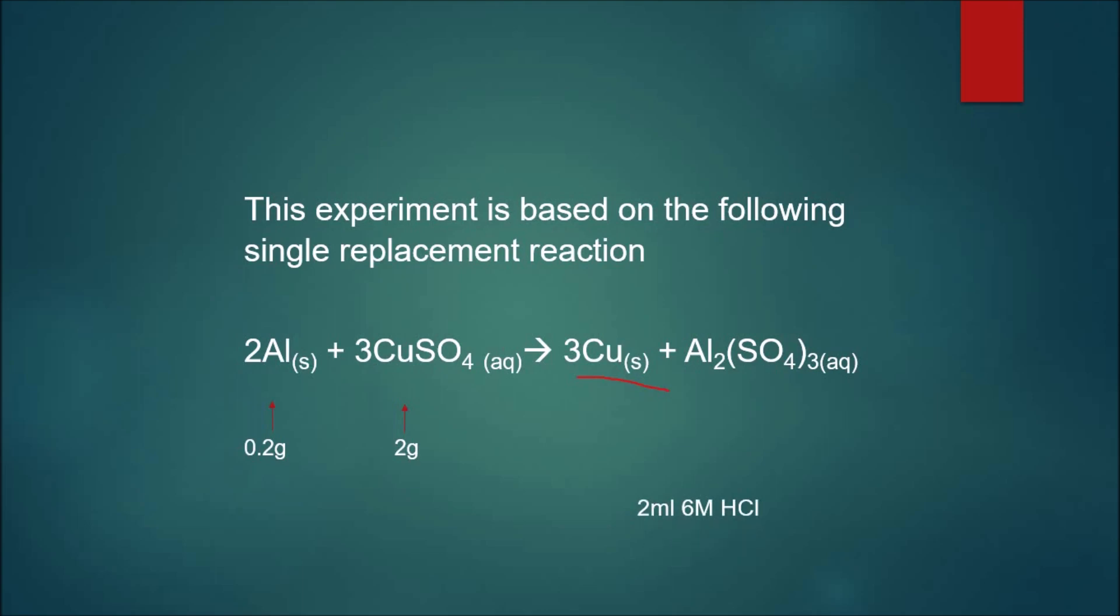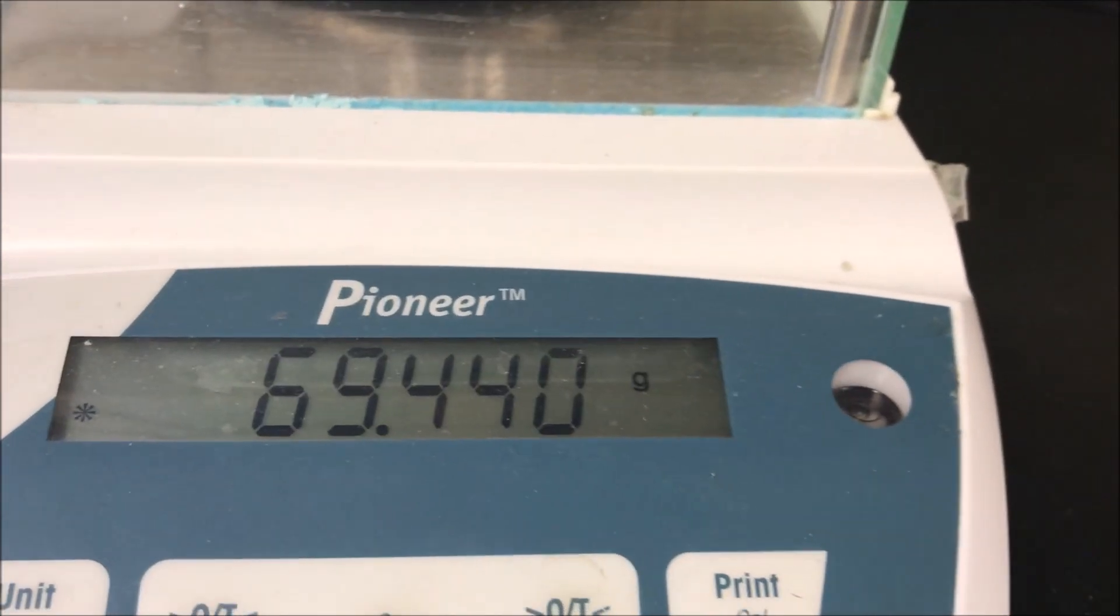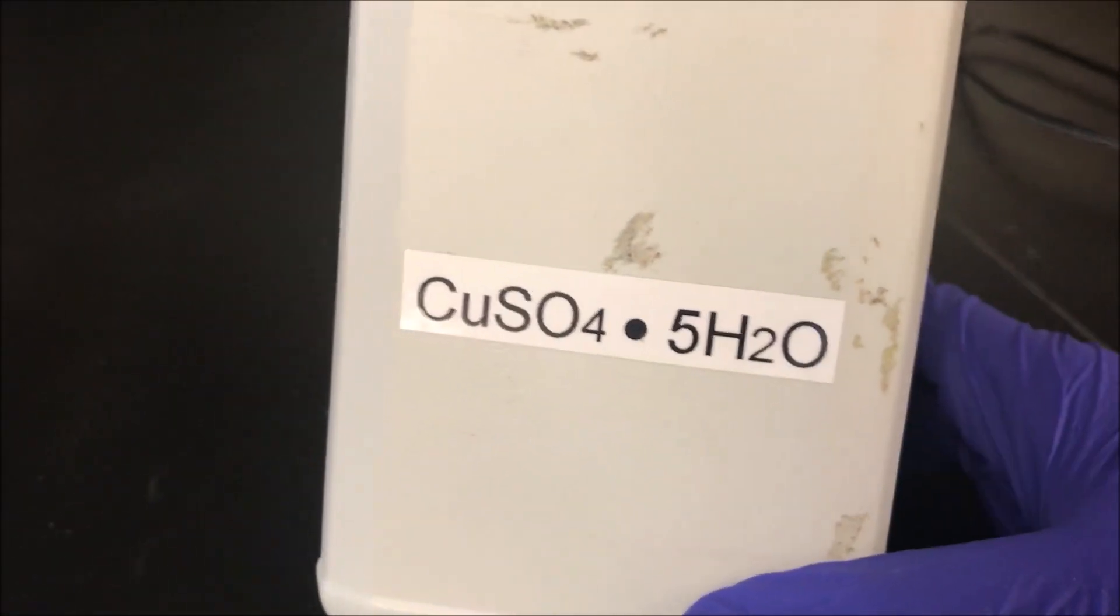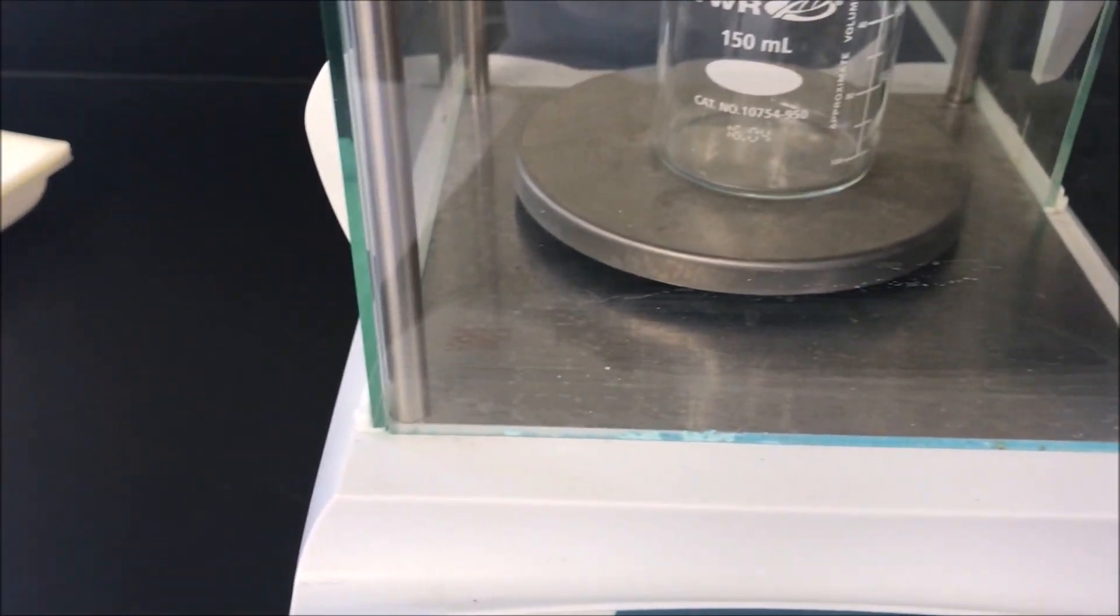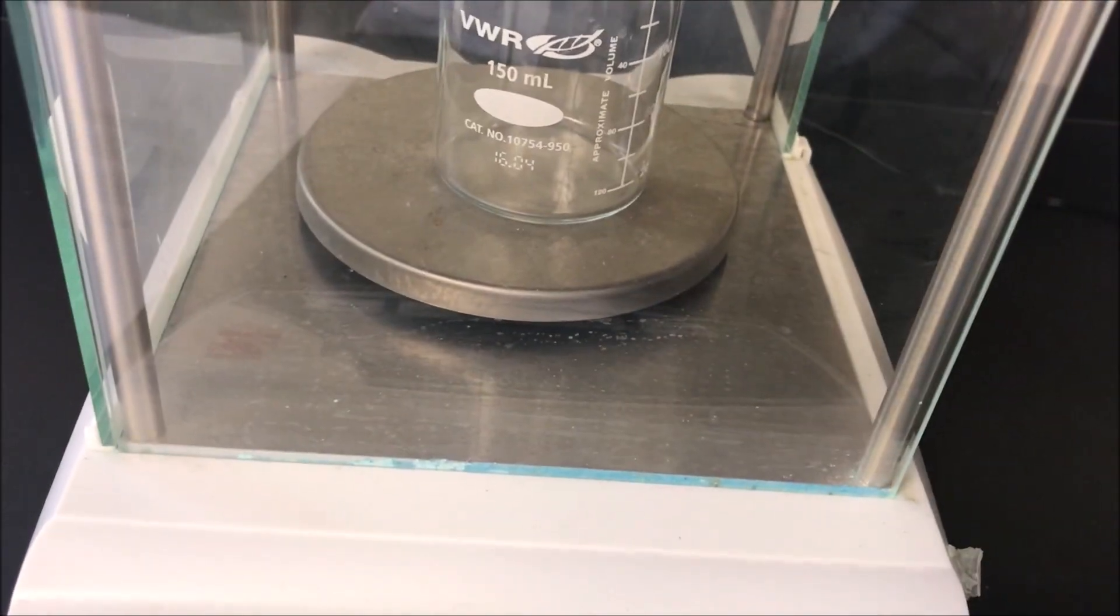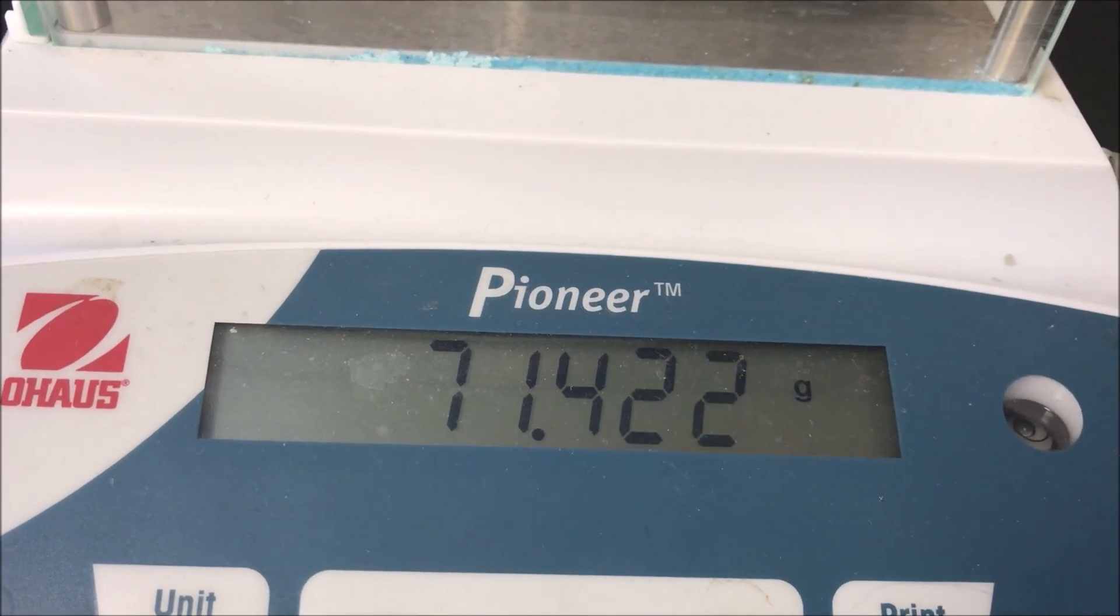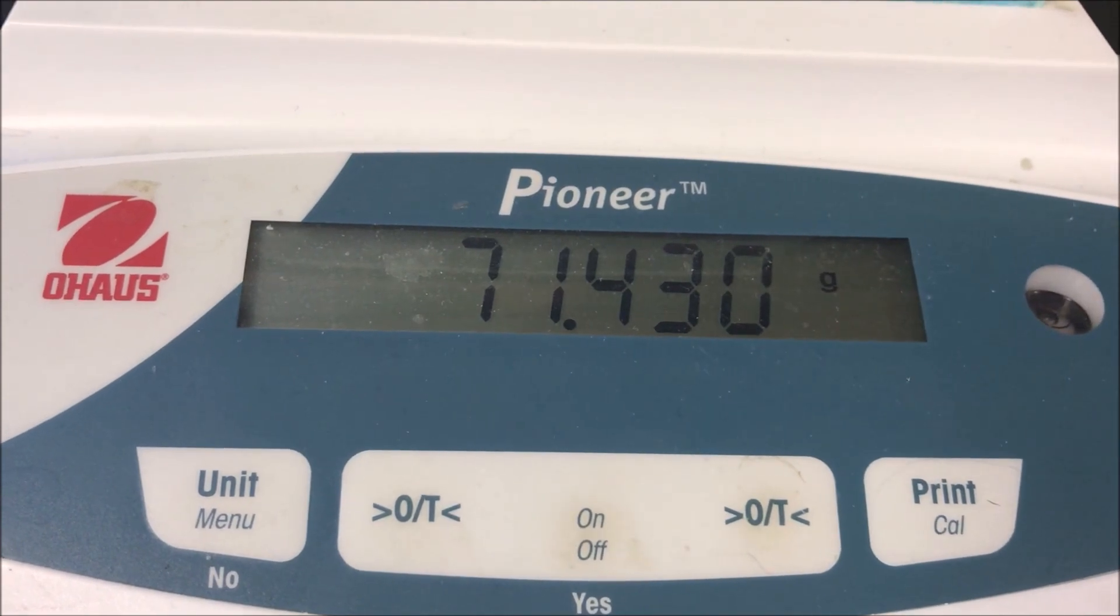First we weigh an empty beaker and add 2 grams of copper sulfate. We use copper sulfate pentahydrate. The empty weight of the beaker is 69.440 grams. To this, add 2 grams of CuSO4·5H2O copper sulfate pentahydrate. Now note down the value: 71.440 grams.